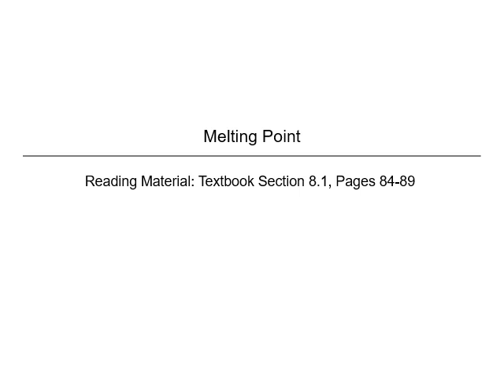This will be a pretty quick overview of melting point, what it means, and some unique properties of it. Then we'll discuss the quick experiment we would have covered in lab, and how to use the DigiMelt melting point apparatus, and that'll be about it.